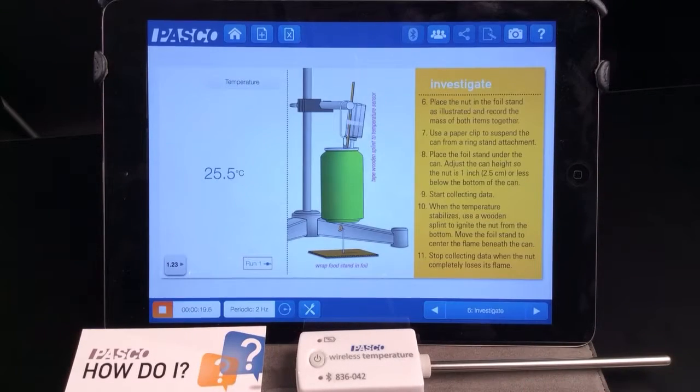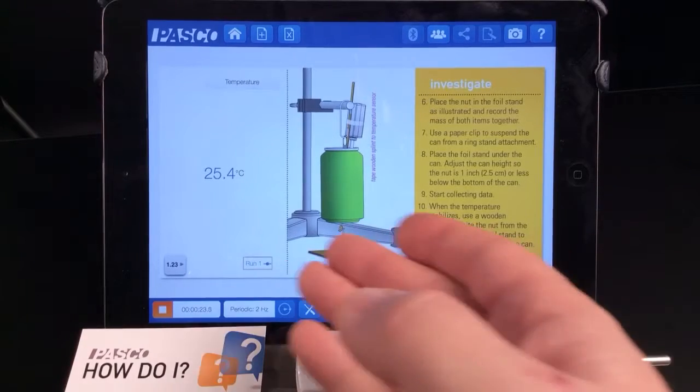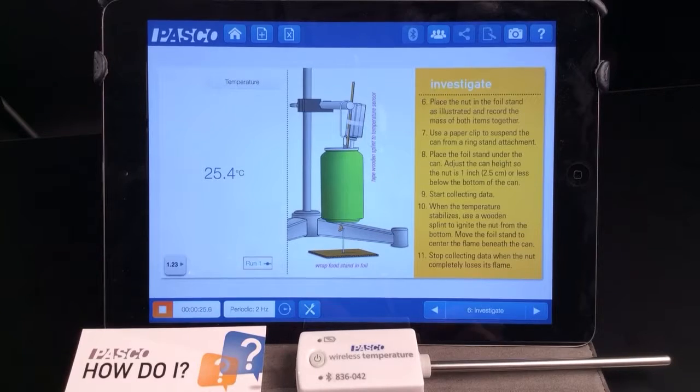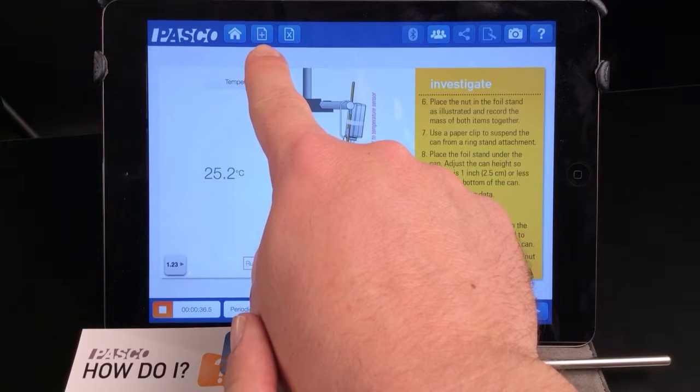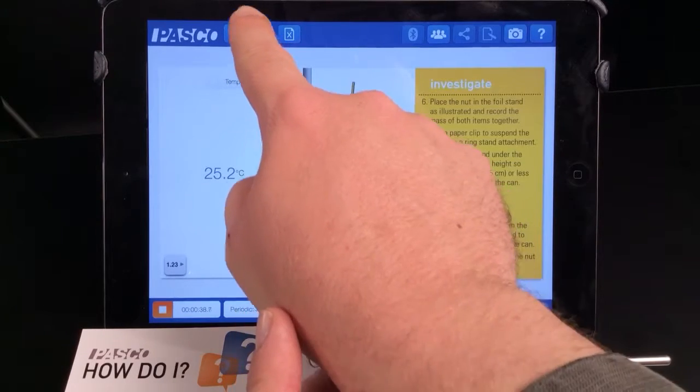So what they can do is choose to create a graph display for their data. I cannot modify the current page, it's full of displays and text and illustrations, but what I can do is create a new page to follow and put my graph display on that page. So to create a new page, I will press the new page icon, this plus sign on a piece of paper in the top bar.